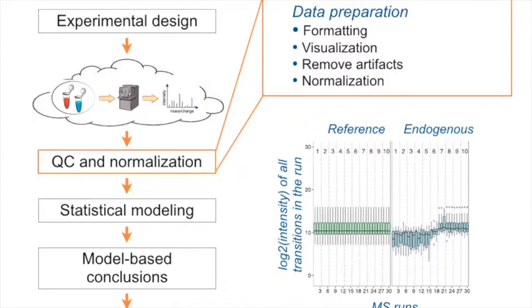Well, you're right, it's not necessarily the number, but more like the proportion of changes. I would say that if you expect 10% of your proteins changing, you can use constant normalization. If it's more like 20 or 30% of things changing, it's getting already in the danger zone. If it's more than 50% of proteins changing, then you really don't want to do endogenous normalization.